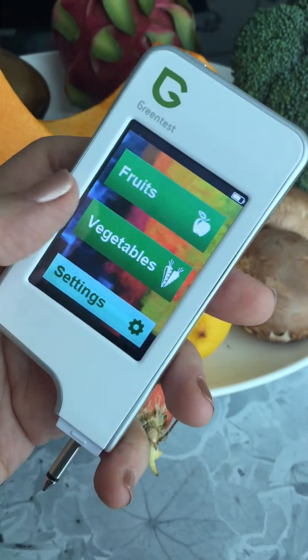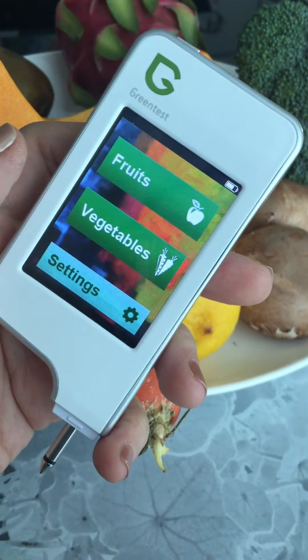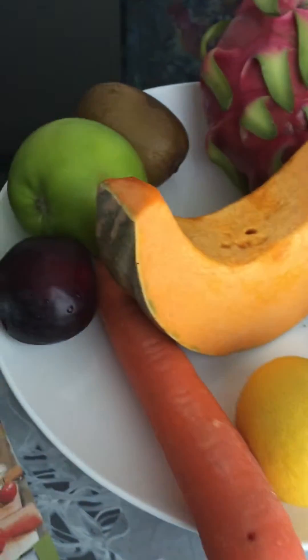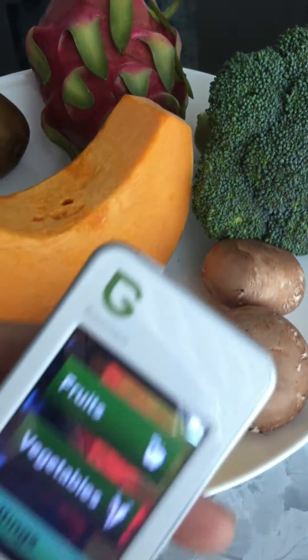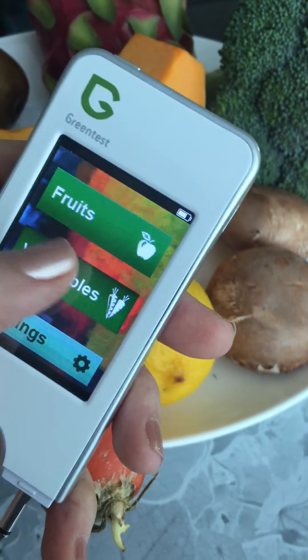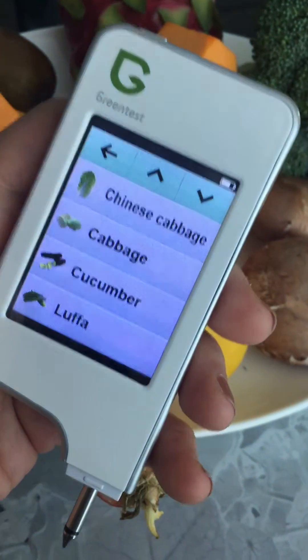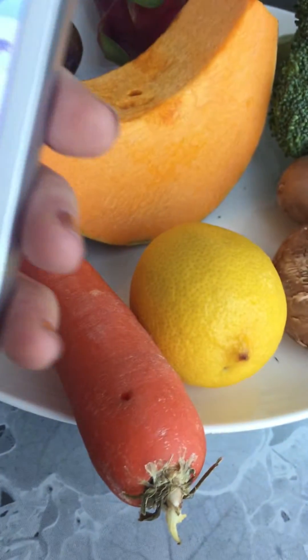How this works is they have a predetermined list of fruit and vegetables. I've got a variety of fruit and vegetables in front of me and I'm curious to test. When you hit the vegetables section, there's a list of items to choose from.